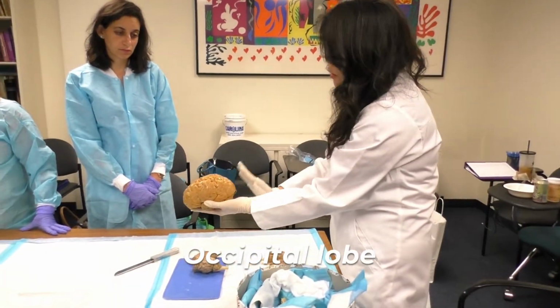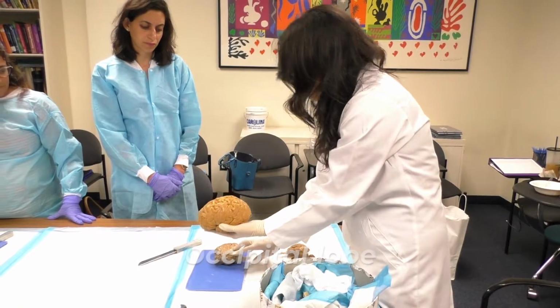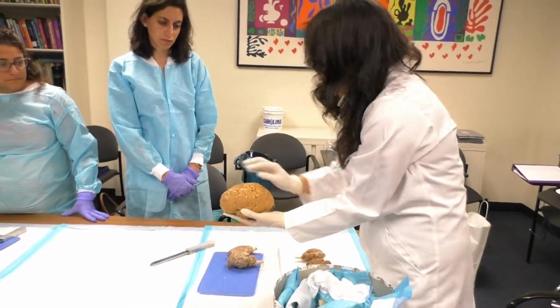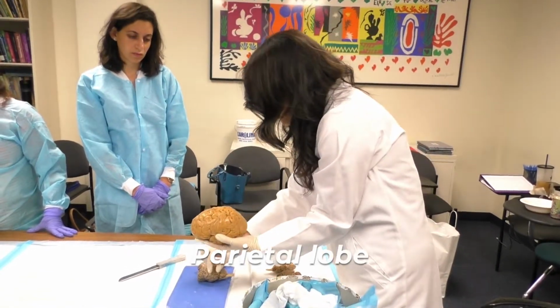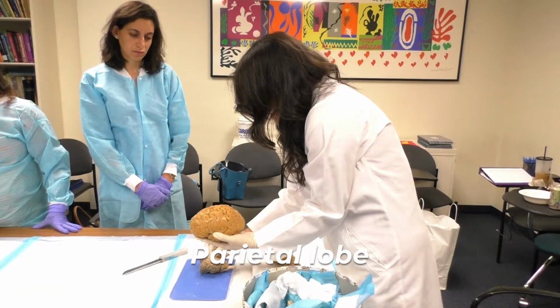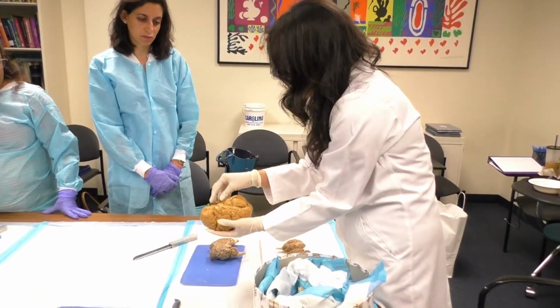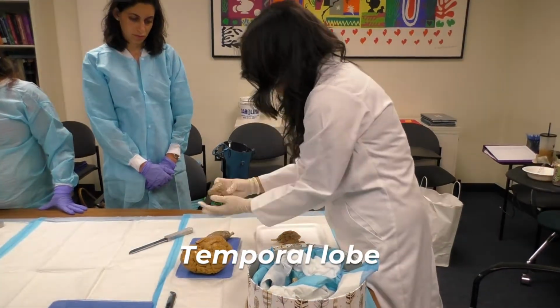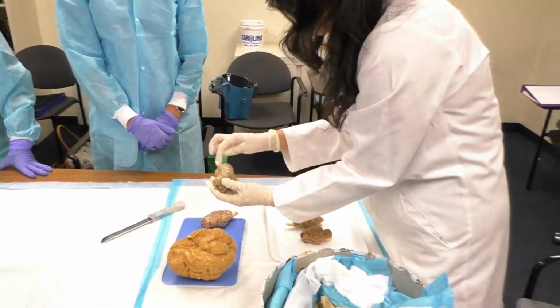Big lobe back here, occipital lobe, important for primary visual senses. The lobe between the frontal and the occipital lobe is right about here. That's parietal lobe, and that would be located right around here. And the last lobe is this lobe right here, the temporal lobe. You can see it's not quite as well differentiated, but it's this region right here in the sheep brain.